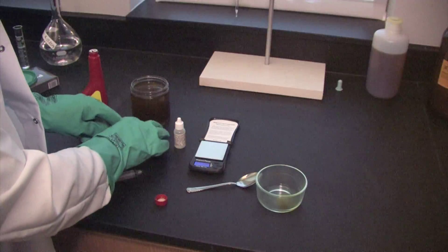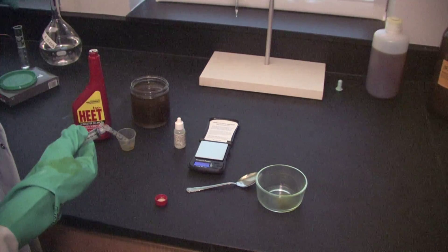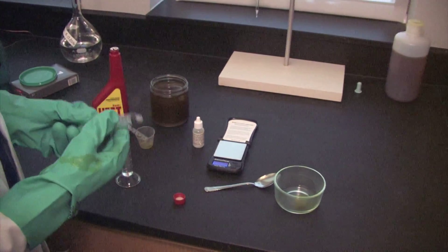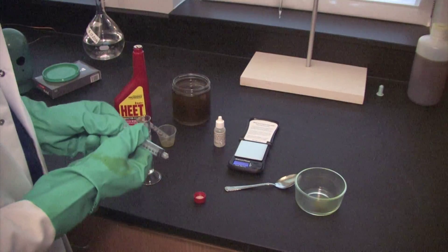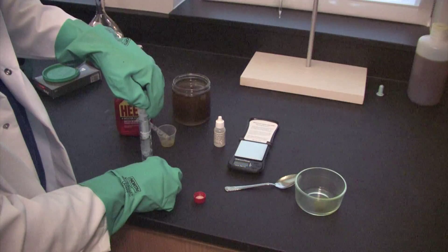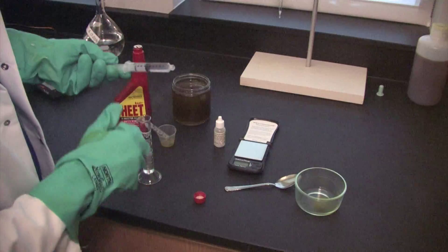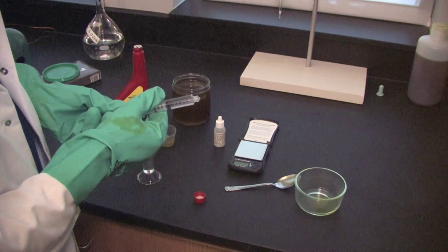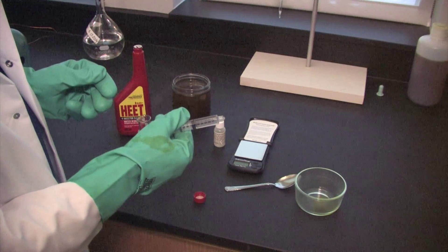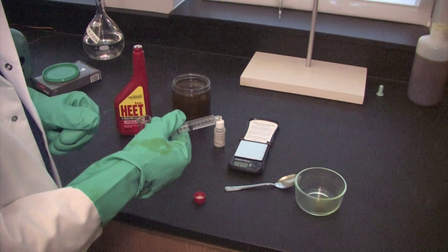The next thing we're going to do is take our larger syringe and draw some potassium hydroxide. The potassium hydroxide is what we're using in the biodiesel conversion process as our base catalyst. We're going to measure how much we start with, then add a certain number of drops until we see the color change, then look at the final volume to know how much potassium hydroxide we added.